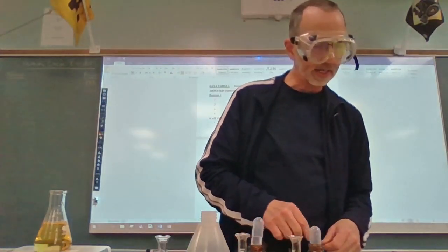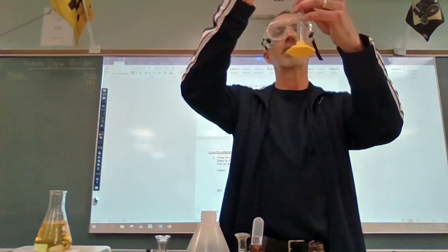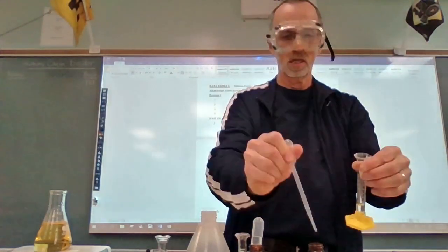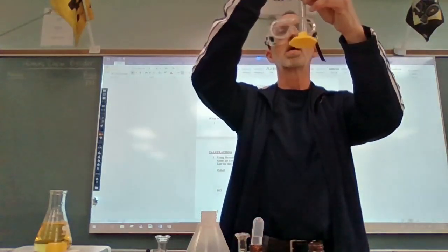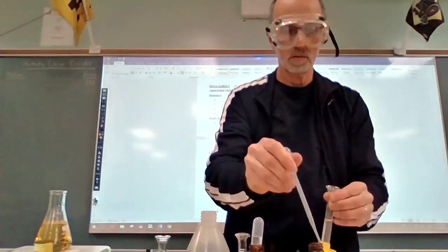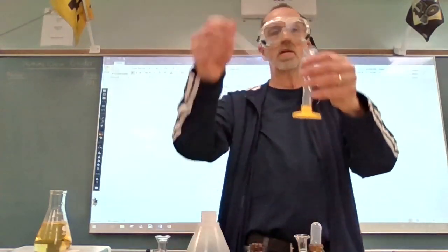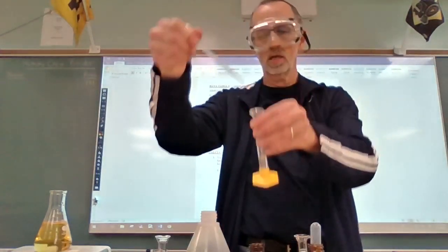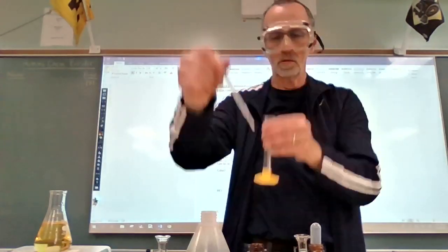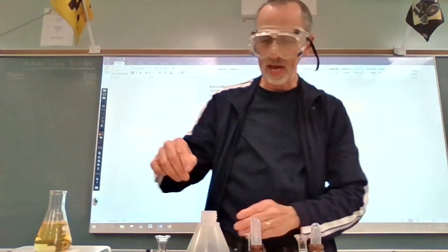So we're going to need 7.5 mLs now of acetone. There we go. 7.5 of HCl. There we go. Only 2.5 water.